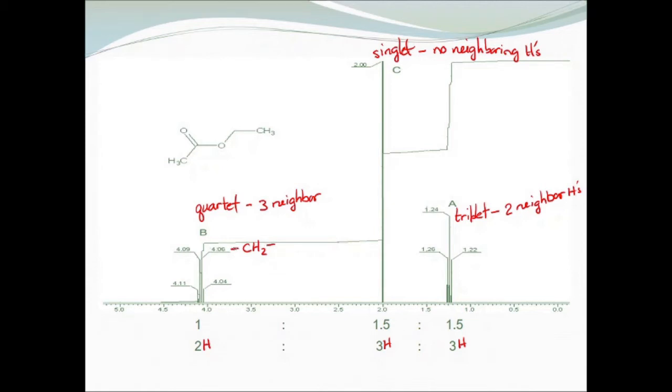Remember, carbon can have 4 bonds total, so we'll write it this way. This is a CH3, and again, that means there's one more thing bonded to this carbon. Likewise, 3 hydrogens, so this is also a CH3. And again, carbon has 4 bonds, so this is bonded to one other thing.